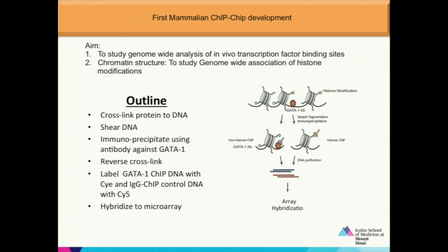So to keep that association together, you have to chemically stick them together. There should be a glue. That chemical glue is formaldehyde. If you add formaldehyde to the cells or the nuclei, that formaldehyde covalently attaches the protein and DNA together. Here the protein-DNA is histone and DNA, and the transcription factors and the DNA.